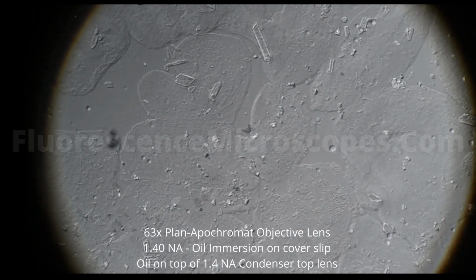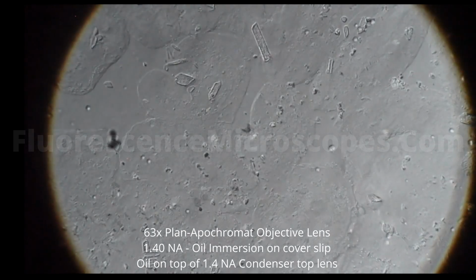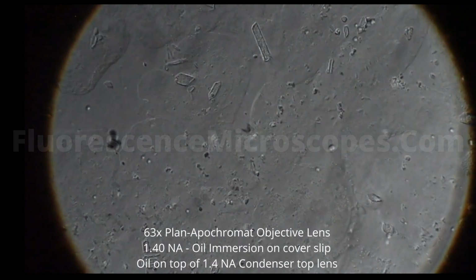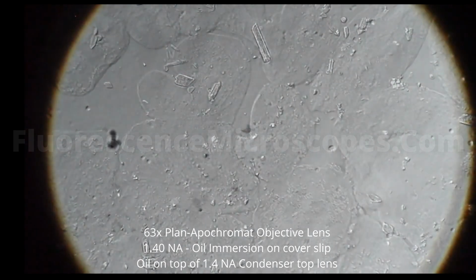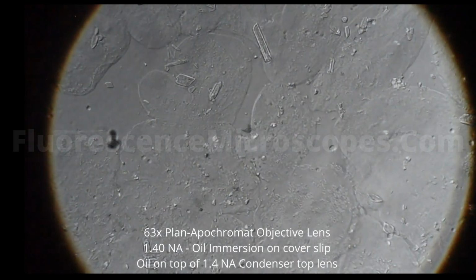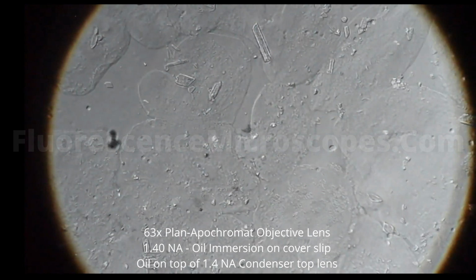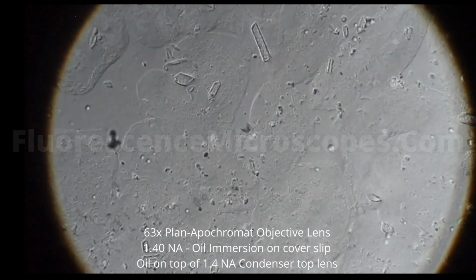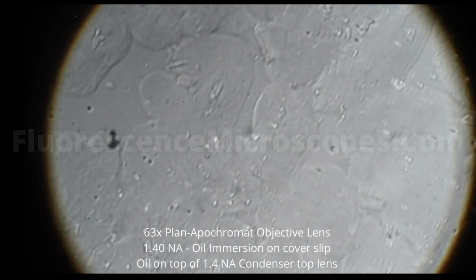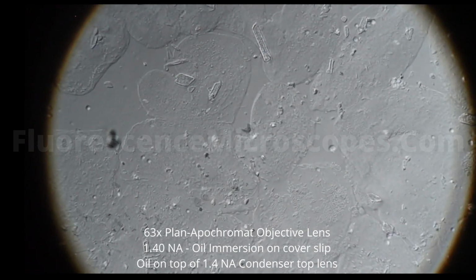With DIC, you've just got to play around with all the adjustments until you get the image that you need, so you can see the details that you need to see. There's not necessarily a right or a wrong as long as you're getting true DIC. If you don't have all the settings right, if you don't have all the right equipment, then you're not going to be getting good DIC. You're not going to get true DIC. Okay, so that is the 63x 1.4 numerical aperture lens.